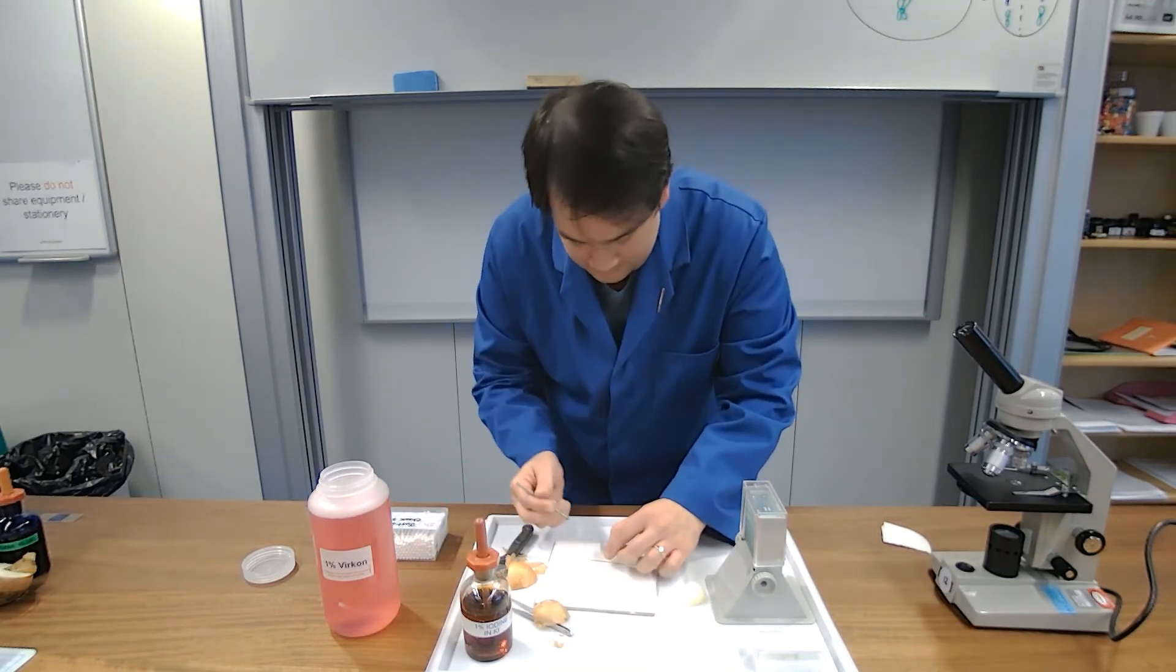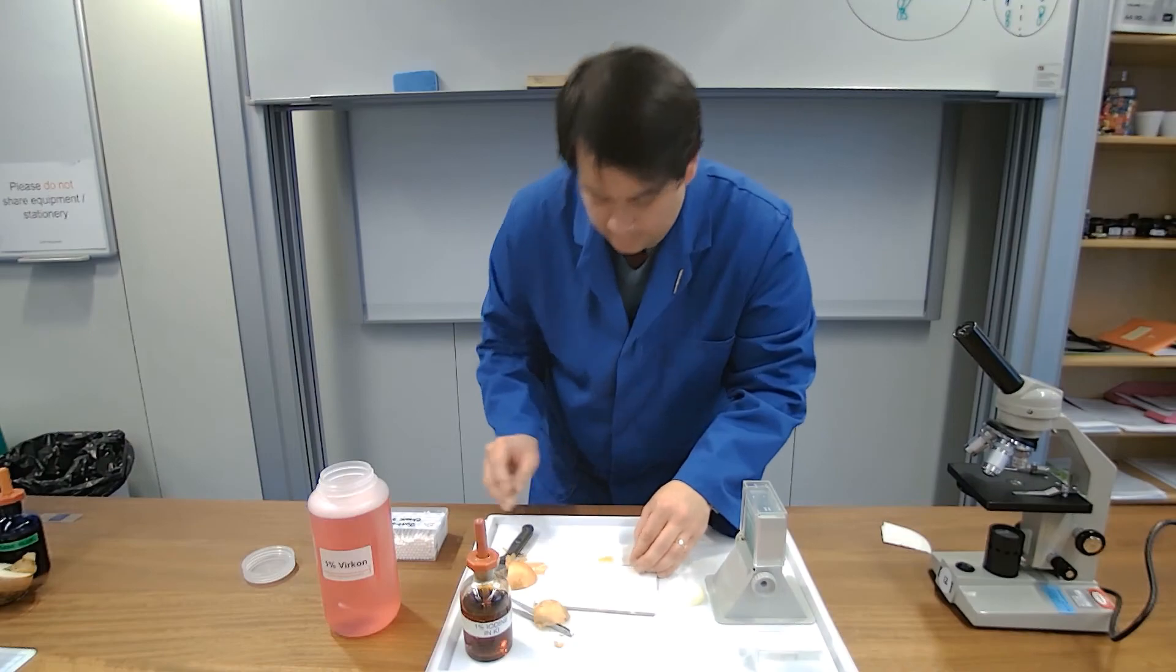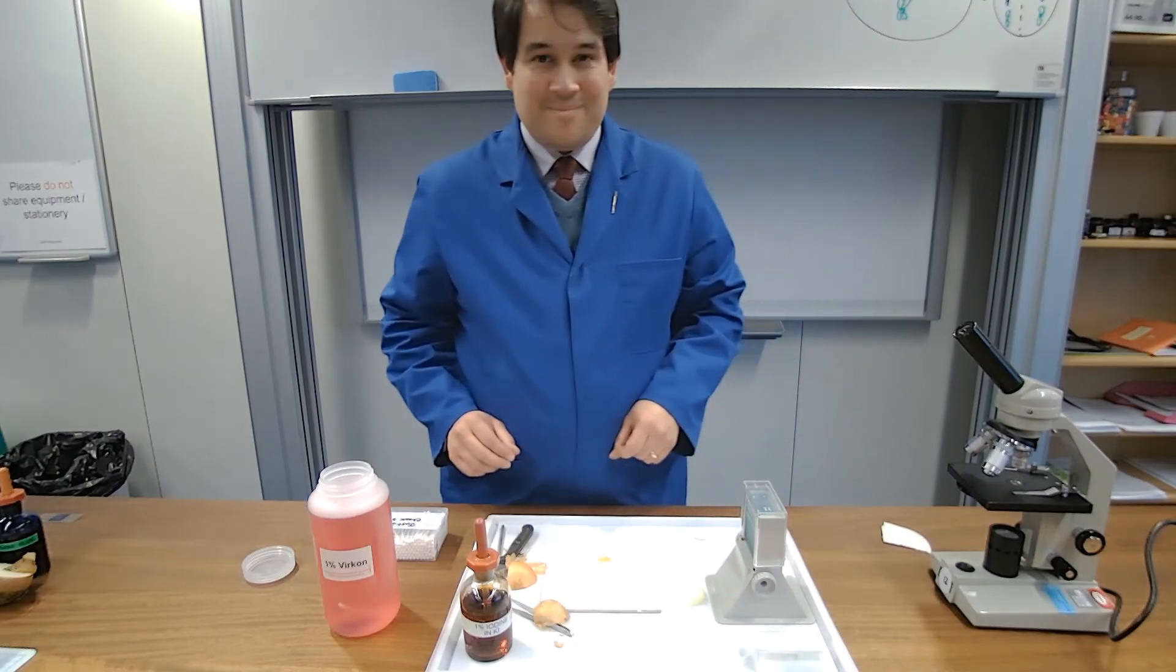We're going to drop the iodine onto it. Cover slip on again. Same technique. We approach the bubble. We lower it. So we have a nice layer.